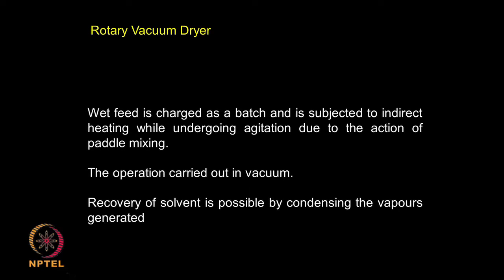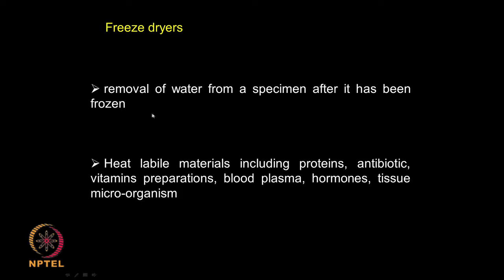So, we can even recover the solvents, especially in this type of dryers, whereas in the other type it may be more difficult to recover this. Freeze dryers: this is done at low temperature. This is almost like lyophilization. We will talk about it in more detail.